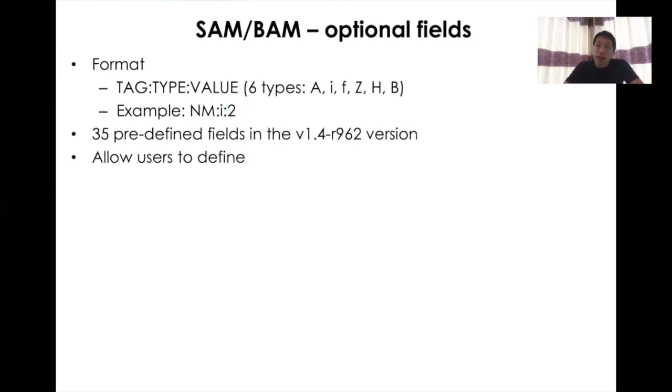And actually, there are many predefined fields of this particular format. I talked briefly about NM, but there are many others as well. And they are actually growing because the BAM files are evolving as well.